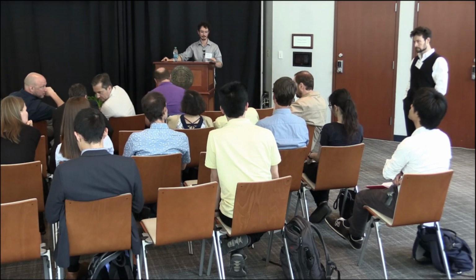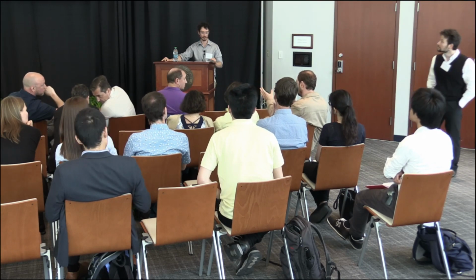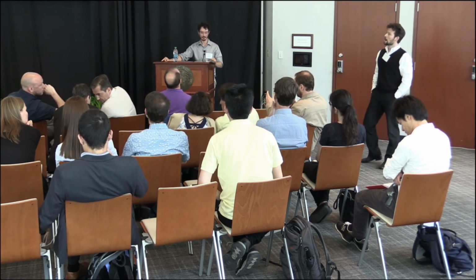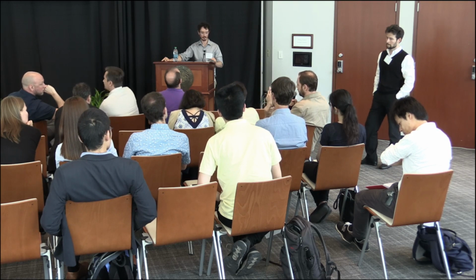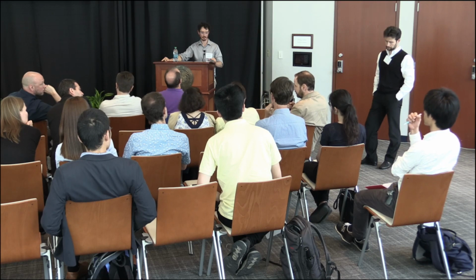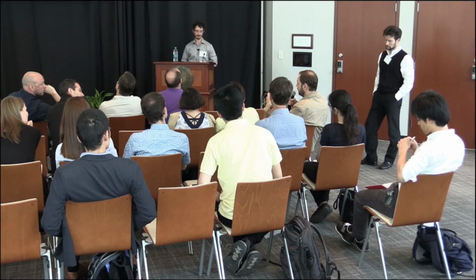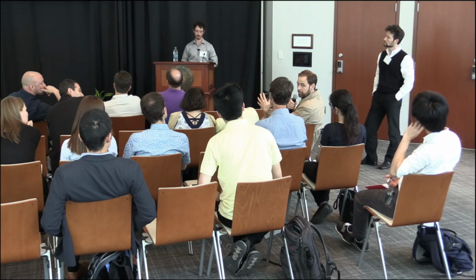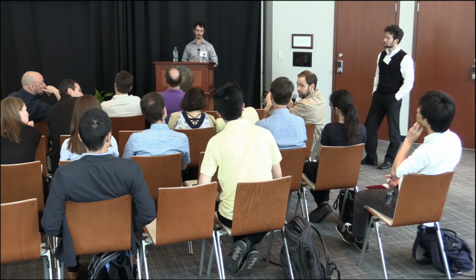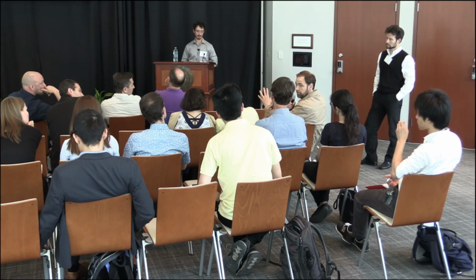Yeah, I just want to comment on the question about the timing, how to not introduce shock. We did play, not for this experiment, before that, with several conditions for the FACS sorting. We tried to sort them directly in water, and we tried different types of buffers for the sorting, but we found that the most gentle way is just to sort them in normal PBS buffer, which is the natural process for anything you do in a sort machine. First of all, the cells are not stressed too much because we don't give them weird buffers to start from. And second, since this process was the shortest one from sorting to the freezer, there's almost no way we can see introduction of perturbation, even on the phosphorylation level. I can speak, not for this experiment, but for the bulk samples that we compared with this, and we looked for any phosphorylation, which is the first thing that will pop up if the cells are in shock. So this was a pretty gentle process.